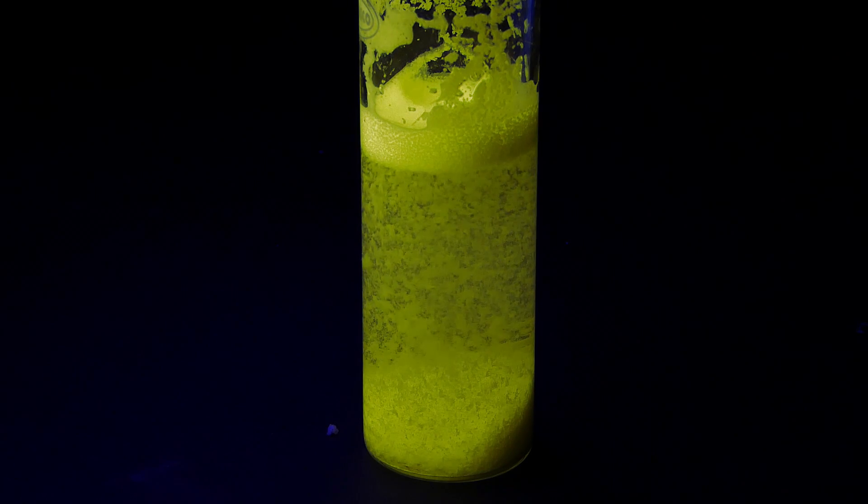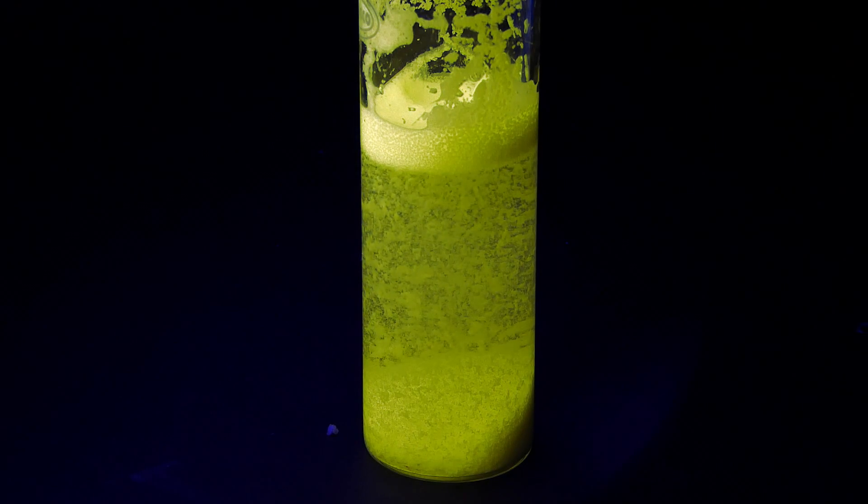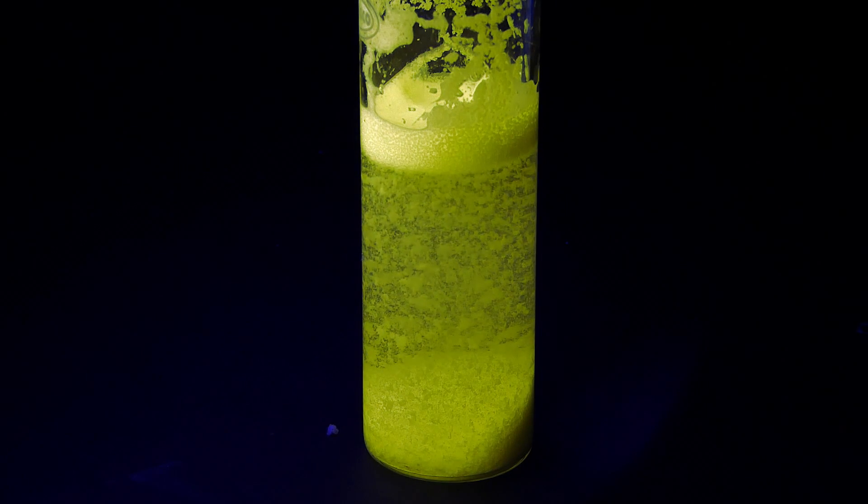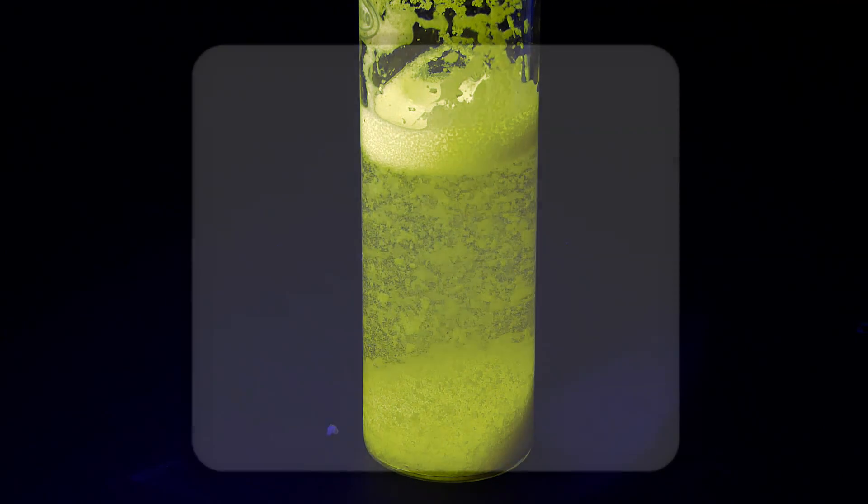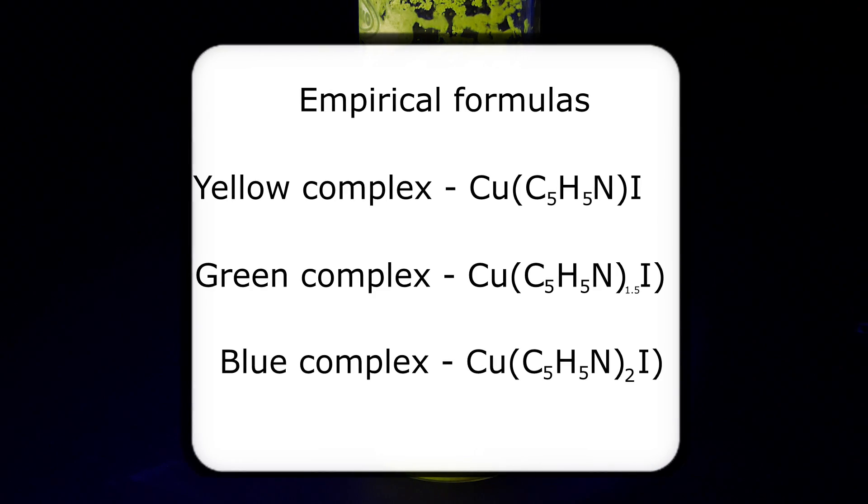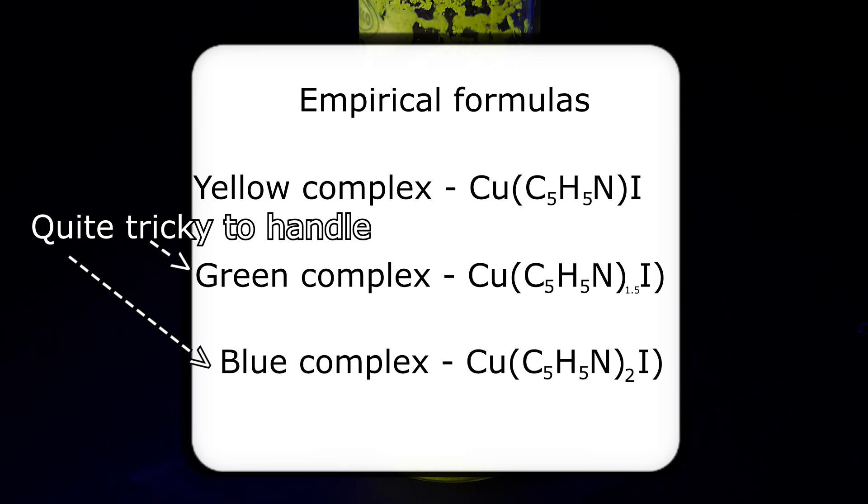Anyway, now that I made the yellow complex, there are technically two still ahead of me, but they are a little bit trickier to handle. You see, they have more pyridine molecules per copper atom than the yellow one, and that makes them quite unstable, meaning that they can turn into the yellow complex and lose their unique colors quite easily. They also cannot be handled dry or even slightly wet, and the only way to store them for a long time is in a weak pyridine solution in water.